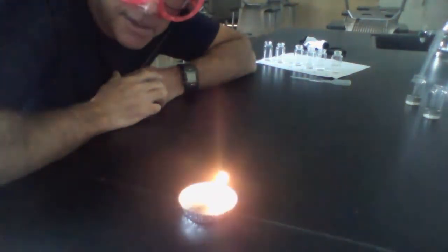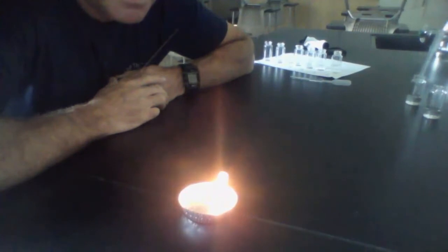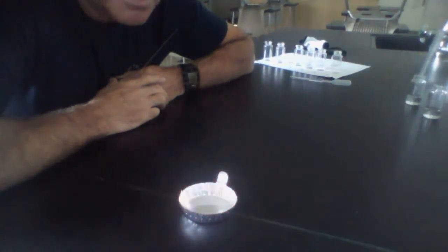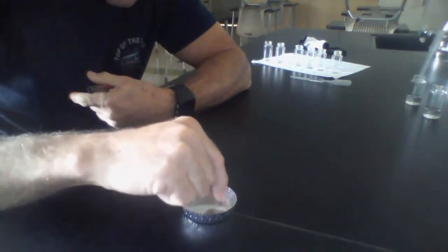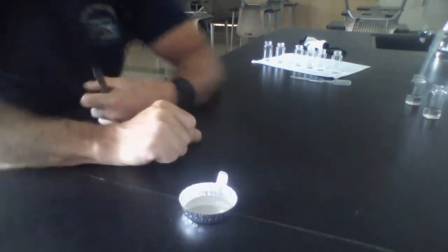Oh, it's showing up very different in the camera. Tiny flame dancing around. Oh, look at that. And gone. Yeah, it formed this cool little candle that seemed to move around. Not sure if that's significant or not.